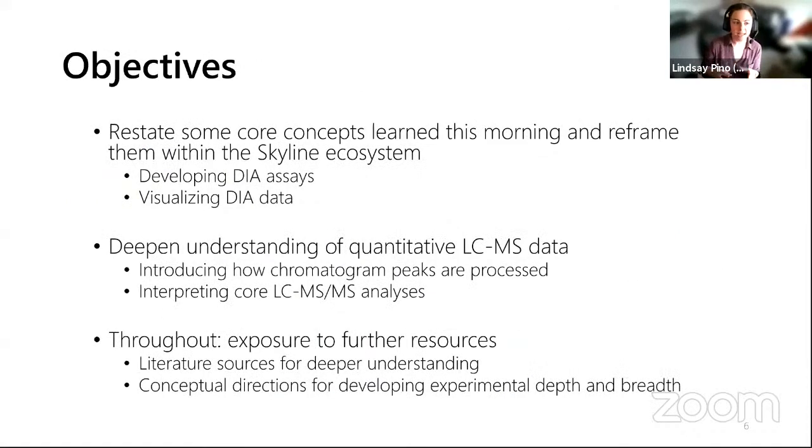So as I had mentioned, I have three main objectives for everyone today. The first, I want to revisit some of those core concepts that Brian gave you a theoretical framework for this morning. And I want to reframe them using the Skyline ecosystem. The two main things here are going to be developing DIA assays and visualizing DIA data. I want to give us a deeper understanding for quantitative liquid chromatography mass spectrometry data, including how chromatogram peaks are processed in Skyline.